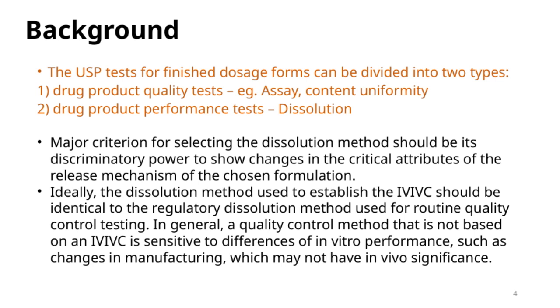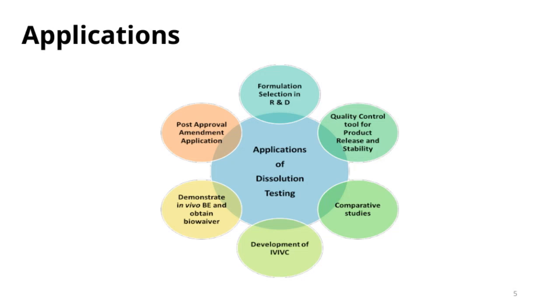Understanding these distinctions and selecting the appropriate dissolution method based on these criteria are crucial steps in ensuring both product quality and therapeutic efficacy. Let's take a closer look at some of the key applications of this technology.